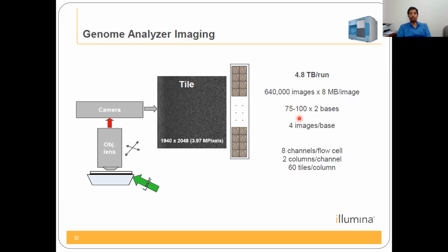So as I told you, there is a limitation. It is not going to sequence all thousand or 600. It can sequence around 100 only at a time. So 100 it will do, and times 2, I explained to you why it is 2. It is called paired end sequencing. And 100 times, every nucleotide, 4 images for each tile.